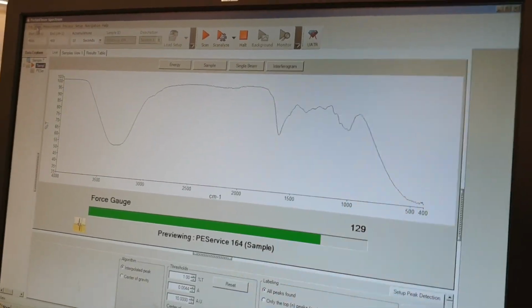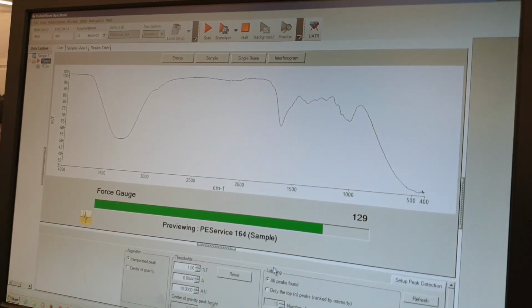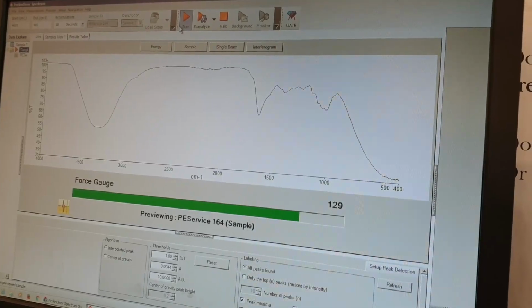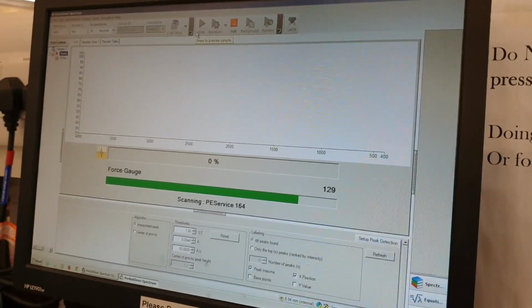Whoops. Oh wait, has it not finished scanning yet? Is it still scanning? Oh wait, what? Click scan once more, and it should complete it. Usually you have to click scan twice. I don't know why. There we go. Now it's actually doing the scan.